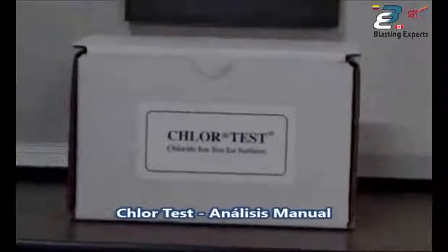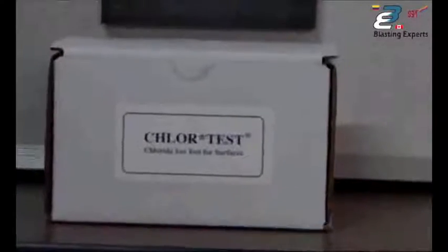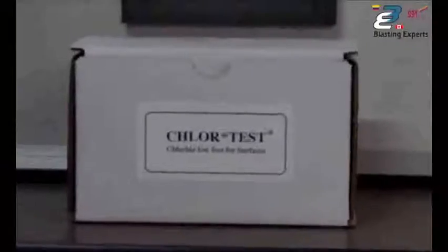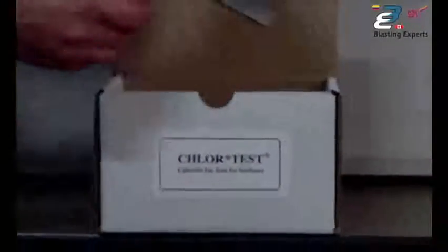We're going to go through the ChlorTest kit with the steps and procedures on how to perform testing. The ChlorTest kit contains everything needed to perform the test. Each kit contains five individual tests.